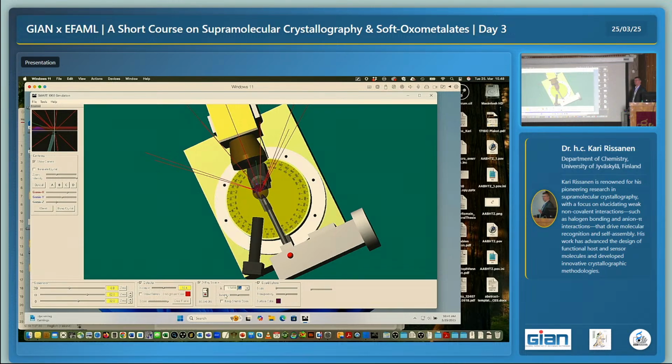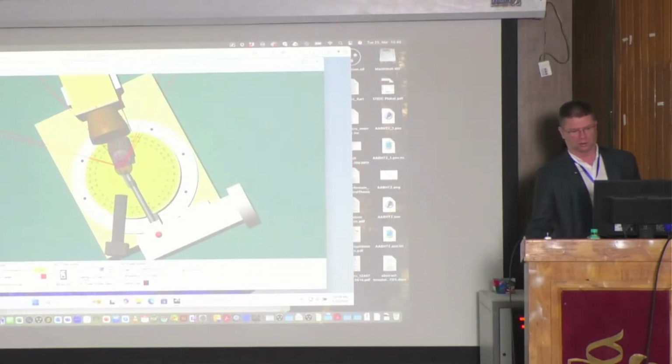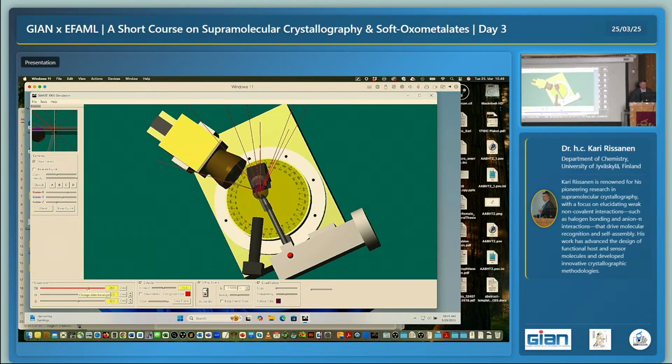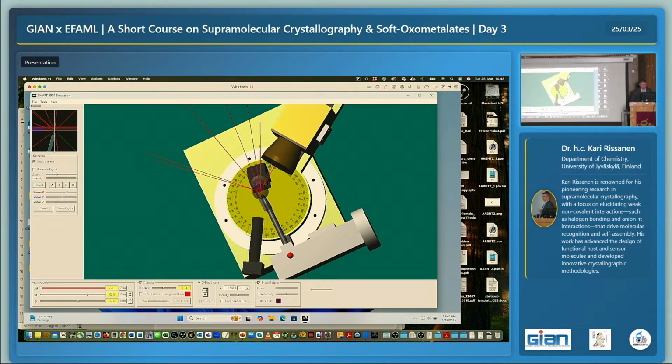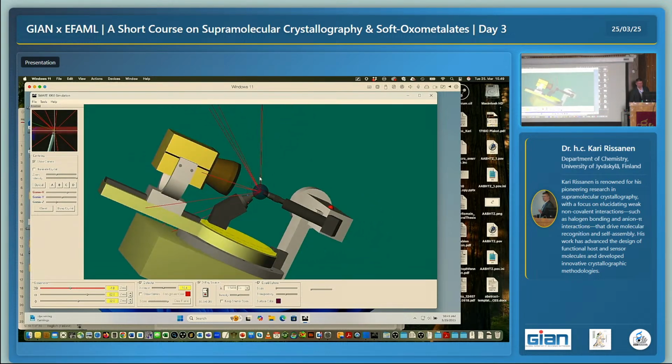Look what happened. Now it spread so much that previously we have to move the detector much more in order to record all the reflections like this. You can see we have to go even somewhere here to do this. And this is why molybdenum radiation and copper radiation are different for the instrument, because the detector in the copper radiation has to move much more. Okay, and then the final, you can see how they spread.